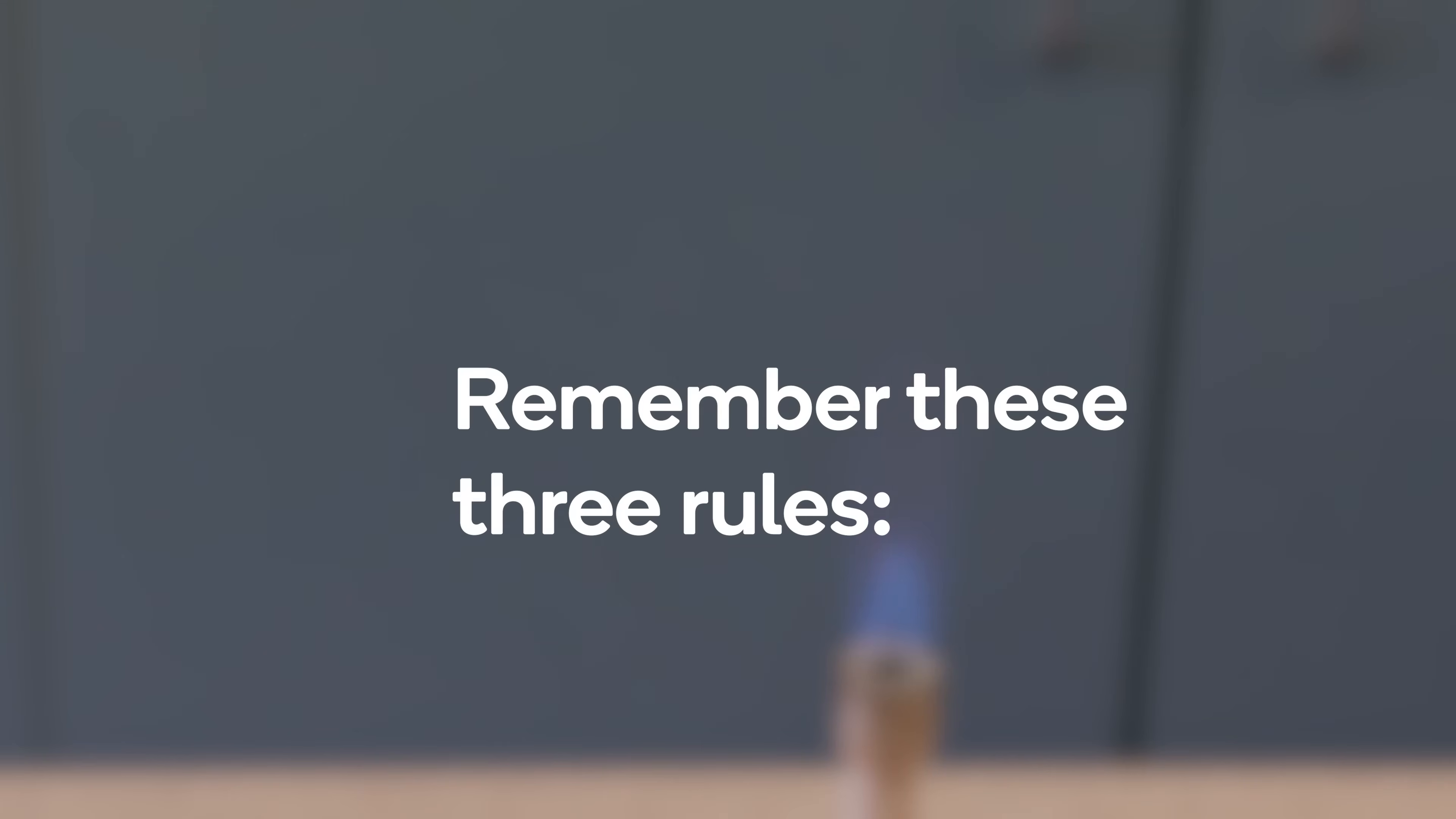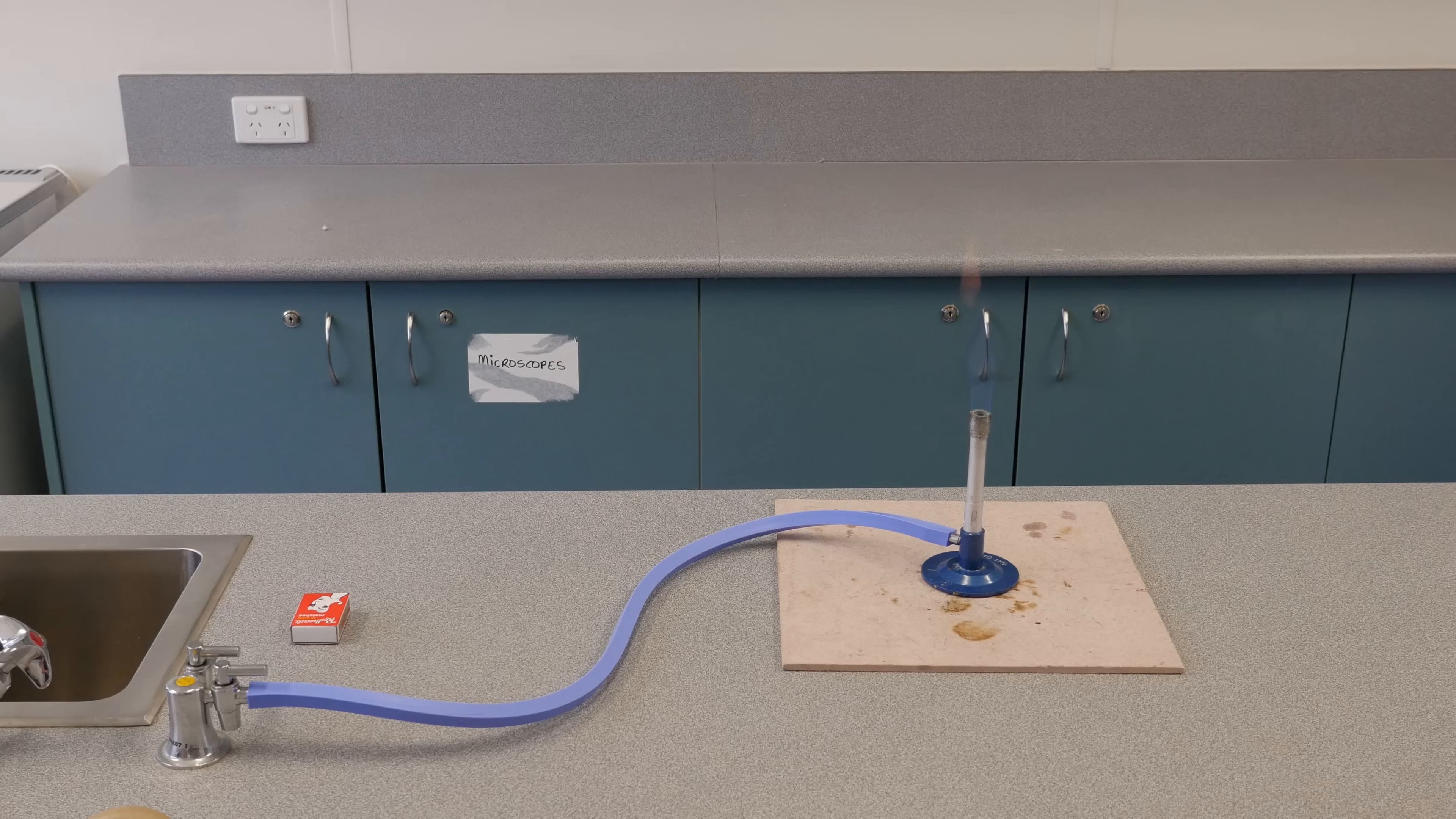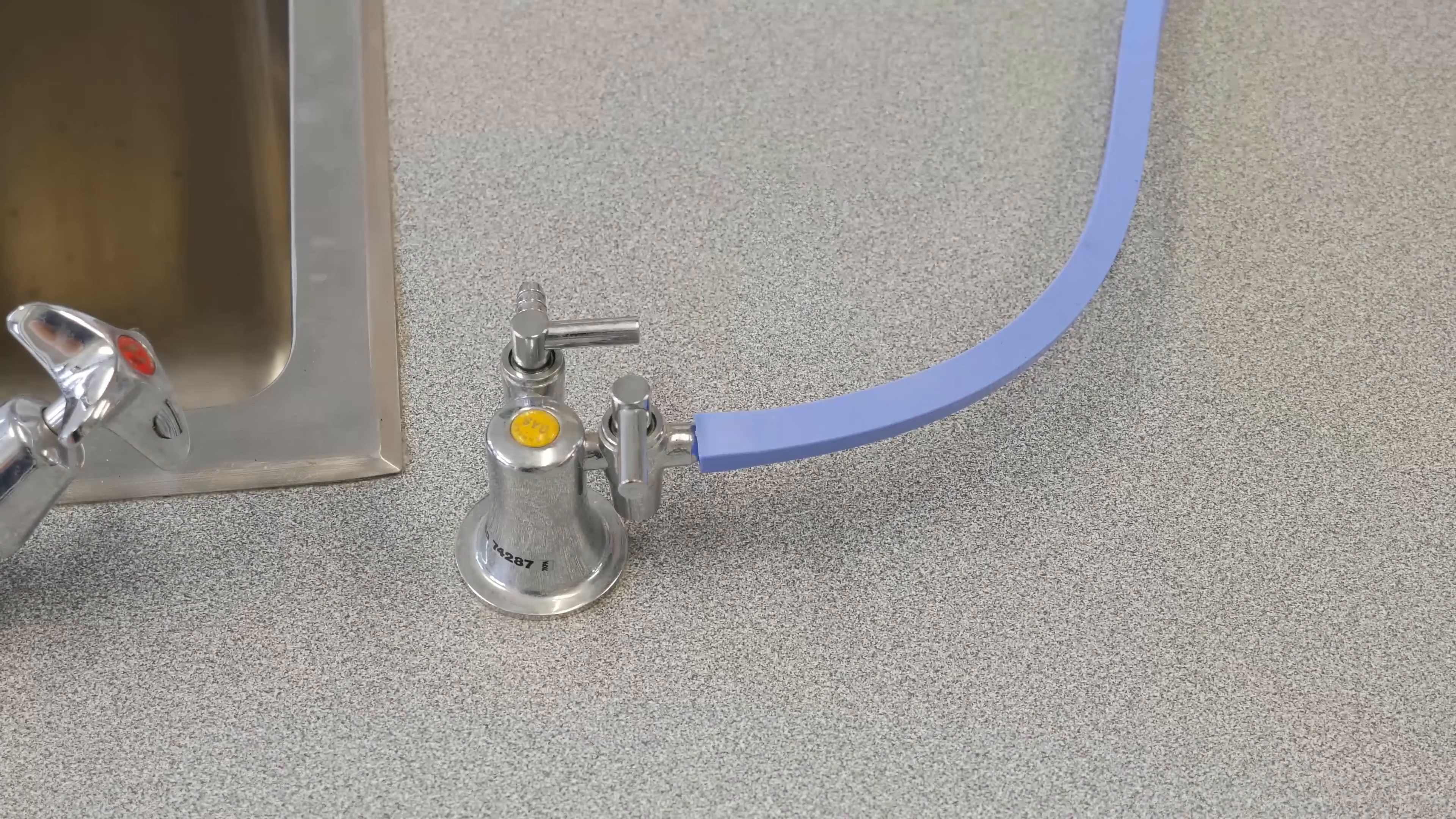There are three more safety rules for using the Bunsen burner while it's lit. If you need to move the burner, hold it by the base. Don't touch it any higher than the collar. Never leave a lit Bunsen burner unattended. And if anything goes wrong, turn off the gas tap immediately.